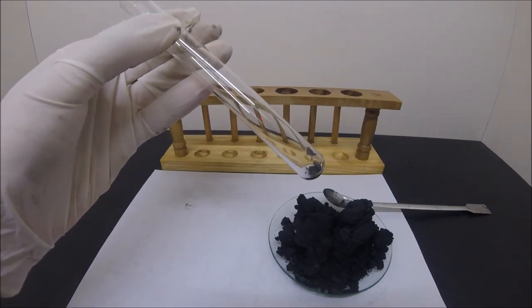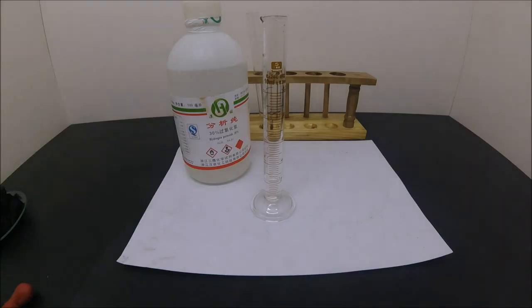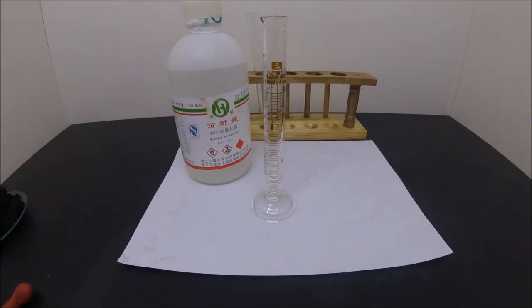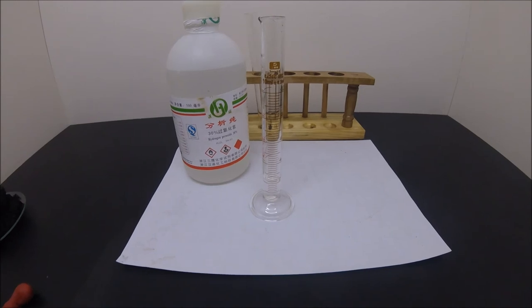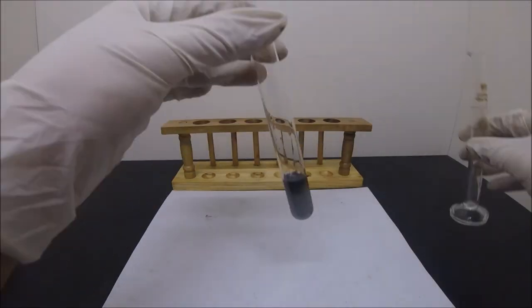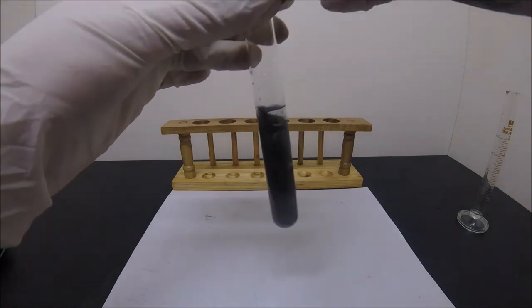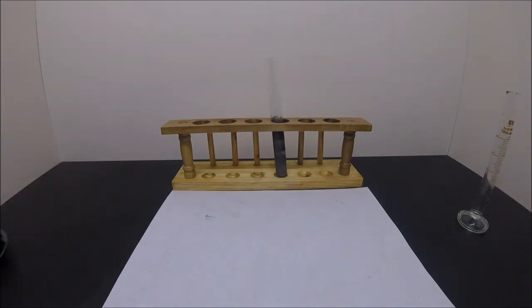Manganese dioxide is a catalyst which fastens the decomposition of hydrogen peroxide and the release oxygen. Here I'm adding 30% hydrogen peroxide into the test tube, and immediately we can see a lot of bubbles formed.